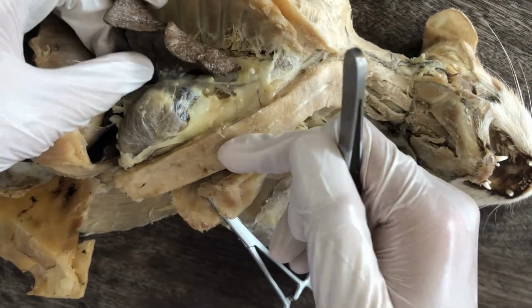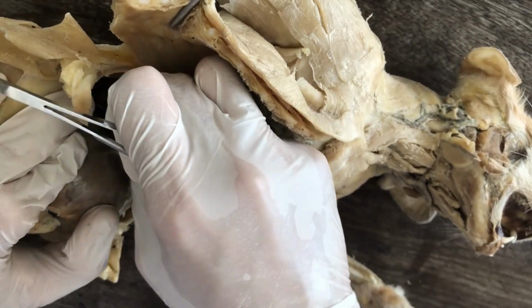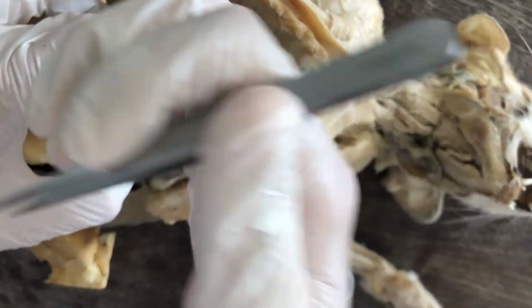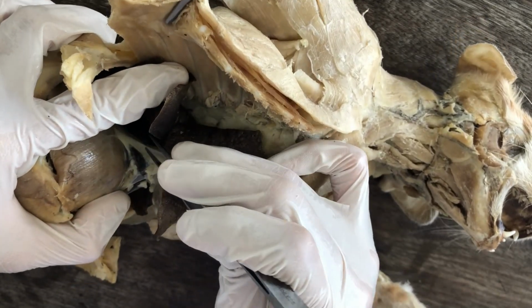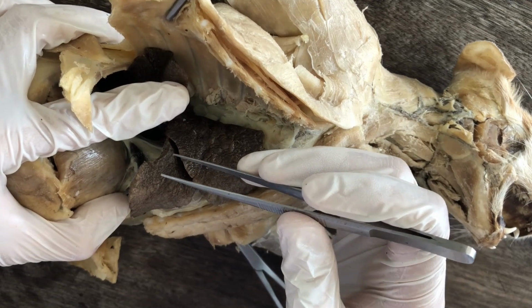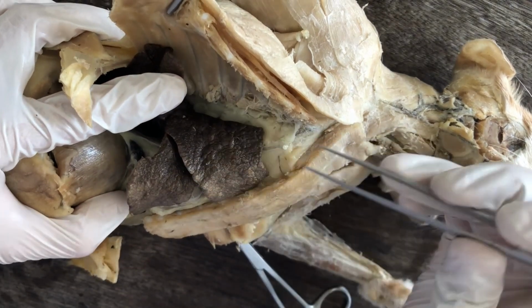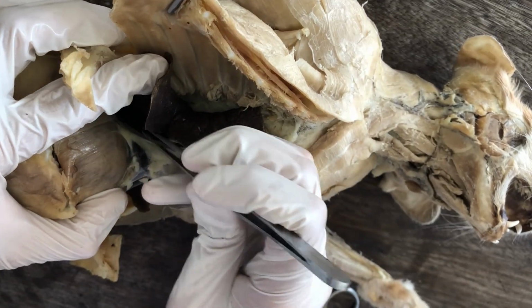And then there's a posterior vena cava or postcaval vein, and it's located within the caval fold that I mentioned earlier, along with the medial lobule of the right posterior lobe of the lung. It's quite a mouthful, but let's look for it.